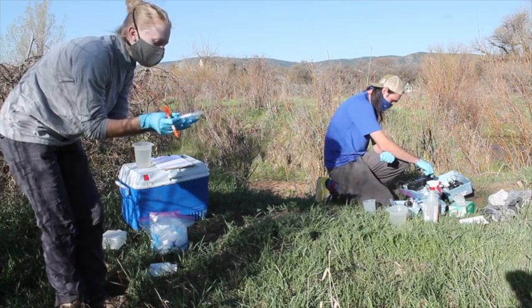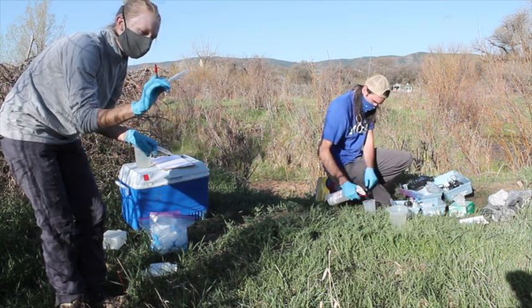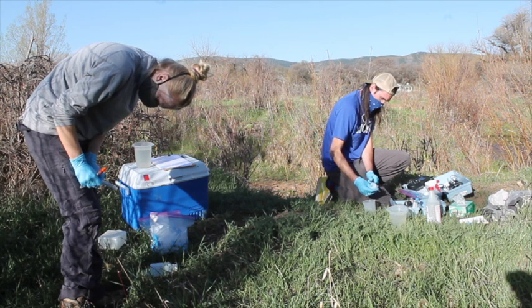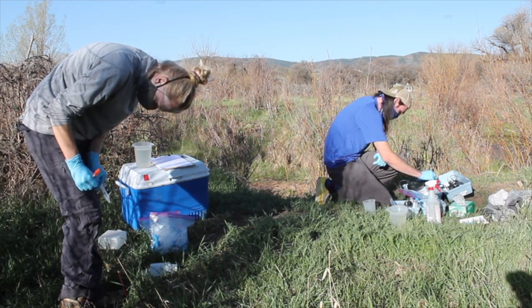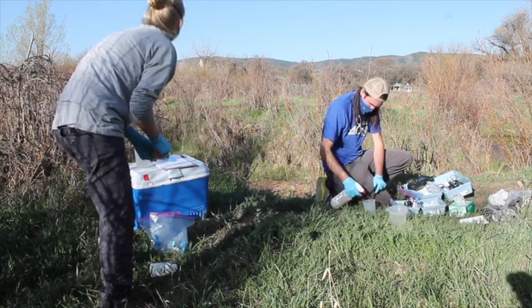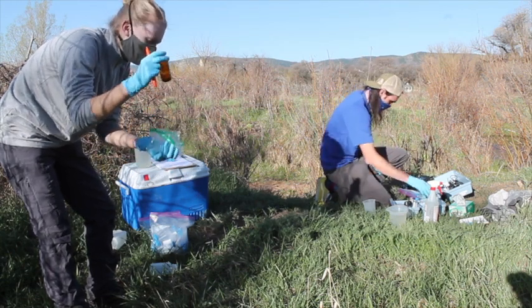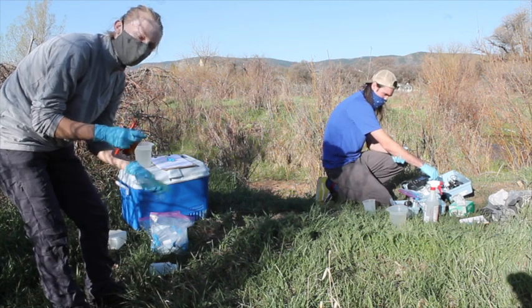Meanwhile, I'm going to label two test tubes: first for metals — dissolved metals, which will be filtered, and total metals, which will not be filtered. We also have an amber vial for filtered samples for COD, anions, and dissolved organic carbon.